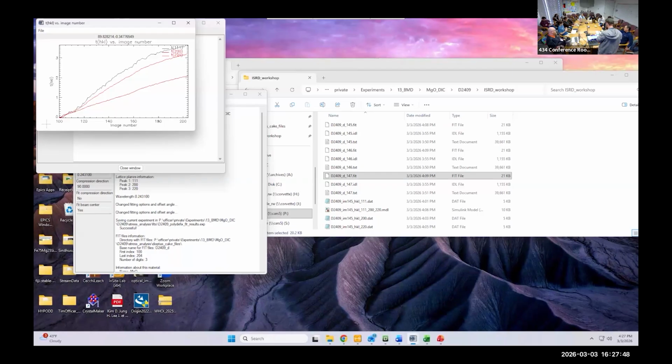Yeah, and that's where if you can't see certain peaks because of the parameters of the experiment, then that's what you were talking about before, where you can change the energy to try to bring the peaks into view because they're just simply not in the Bragg condition to hit the detector. They might be going too wide and they're out here somewhere and you want to change the energy to bring them in. So there are ways to get around it, and that's what comes from multiple repetitions and whatnot. But the nuts and bolts of it, those d-spacings are particular to a particular material.